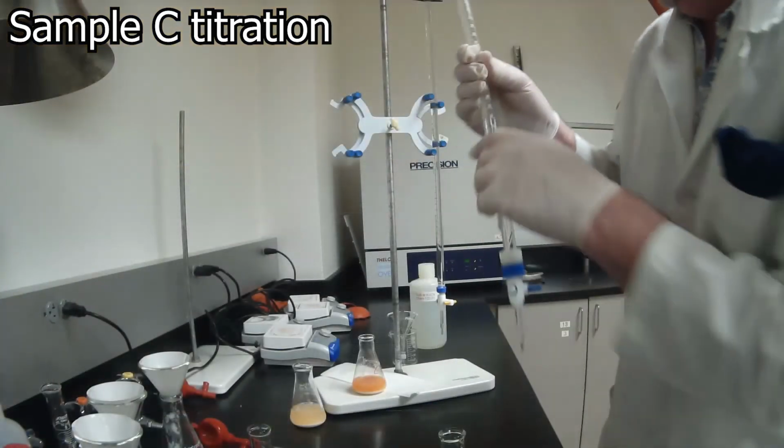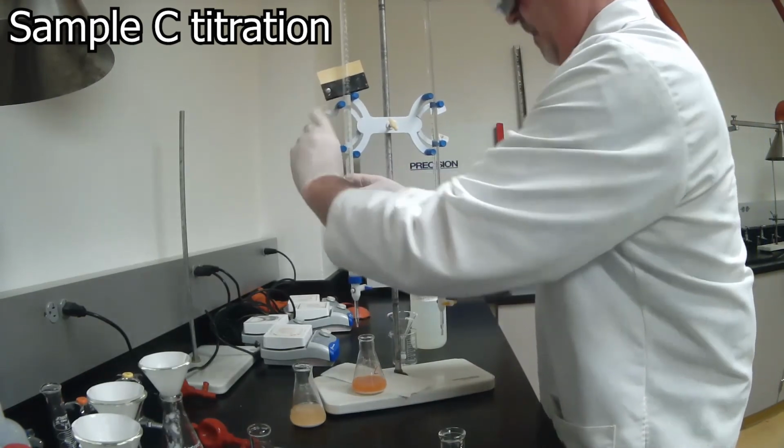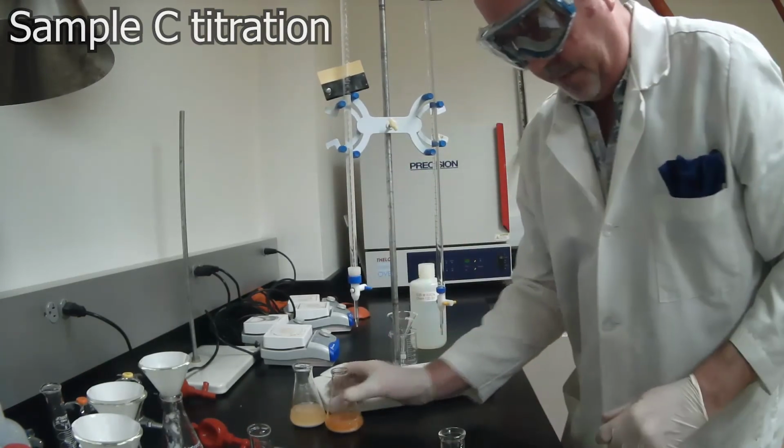It's between the 21 and the 22, and you have to read the bottom of the meniscus and the minor division marks. And so it's just above halfway between 21 and 22. So you can take that down in your lab notebook. That was for sample C.